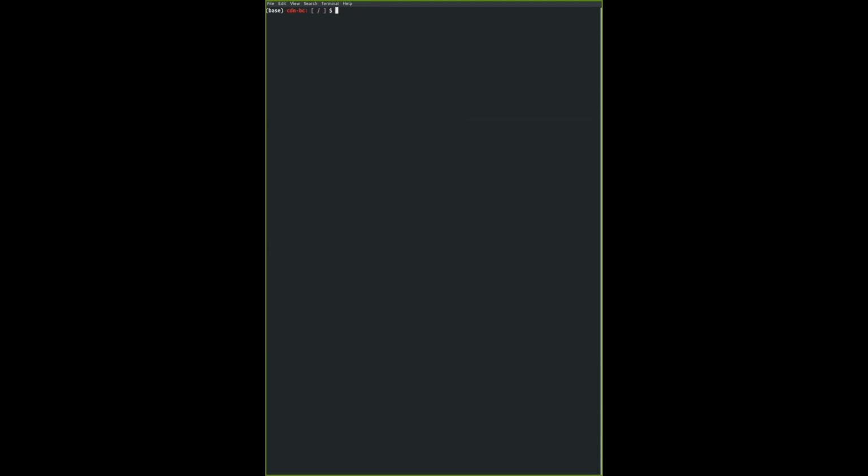Okay, so we're going to move back to a different directory. We're going to get out of root. Not going to stay too long in here. We're going to change directory to desktop. I checked this, all different operating systems should be able to do this. So the function to change directory is cd, followed by a tilde, and /desktop. Give this a try, and you should now see that your working directory has changed to desktop. You can do PWD if you want, and it should say something like users, your name, and then desktop.